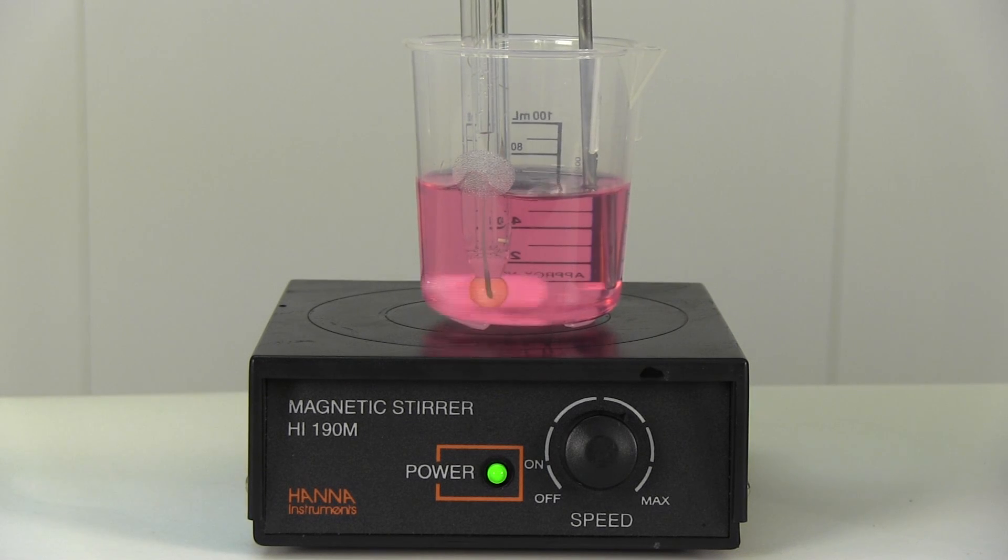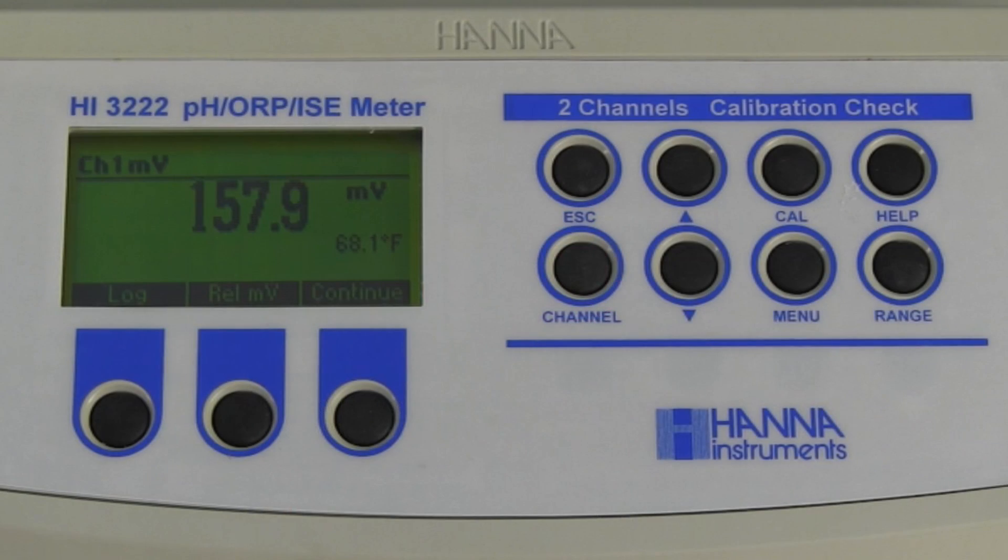In this case, we will use pH 4 buffer, however any other buffer can be used. Our second millivolt value using a pH 4 buffer is 157.9 millivolt.